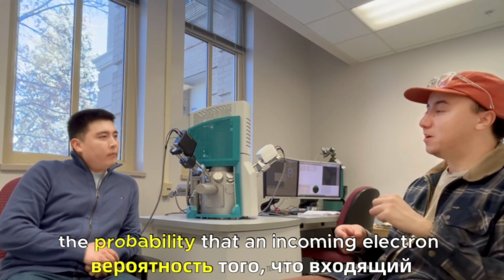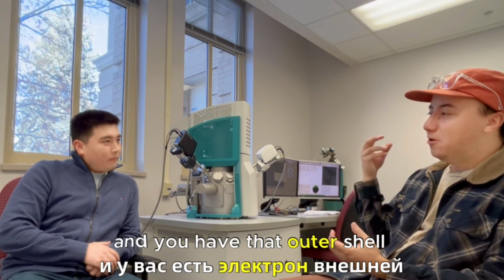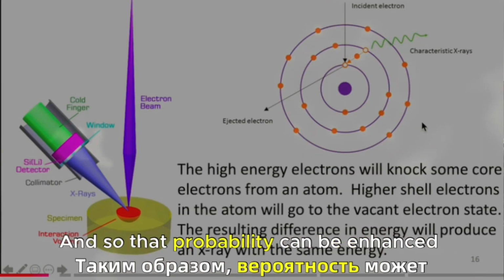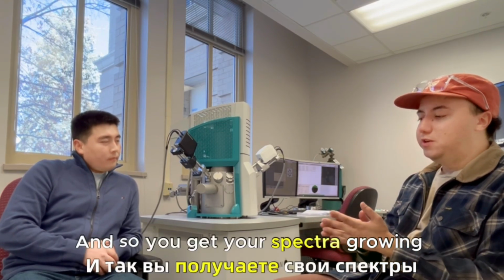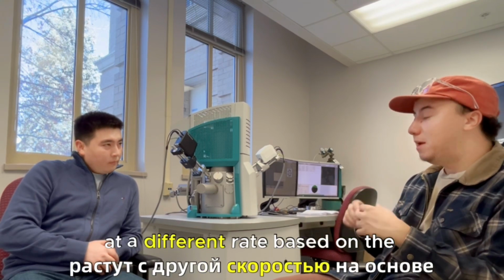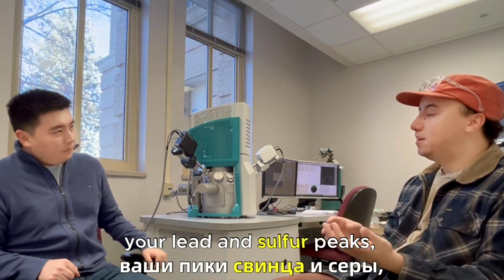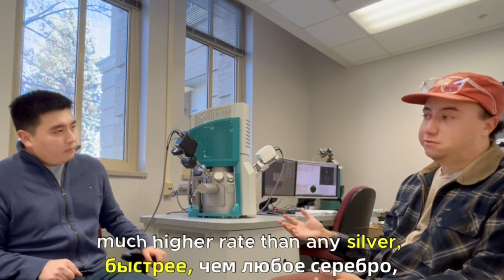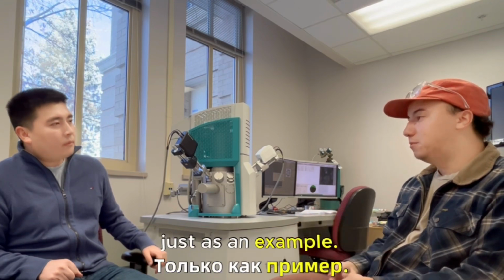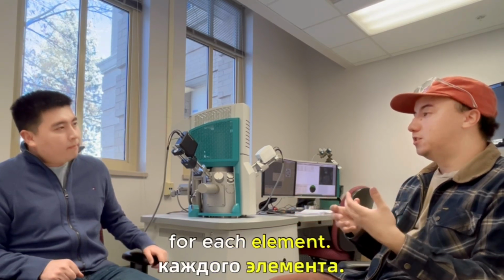The probability that an incoming electron strikes an electron in the material, displaces it, and you have that outer shell electron dropping down and releasing an X-ray. That probability can be enhanced by having a greater concentration of a particular element. And so you get your spectra growing at a different rate based on the concentration of elements in your sample. For example, if you're looking at galena, your lead and sulfur peaks, which overlap, would grow at a much higher rate than any silver, which may or may not be in the galena. Those peaks represent the characteristic X-ray energies for each element.